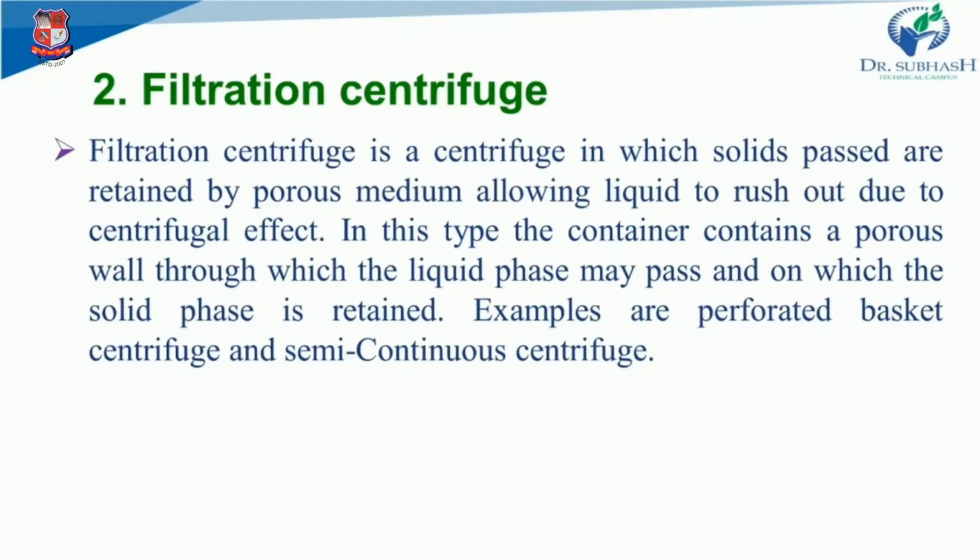This is this type of centrifuge. The only difference here is that it uses centrifugal force or centrifugal effect to separate. There will be a cloth or any porous medium on which the solid particles will be retained. Retained means they will be captured, that solid cannot pass through, right?